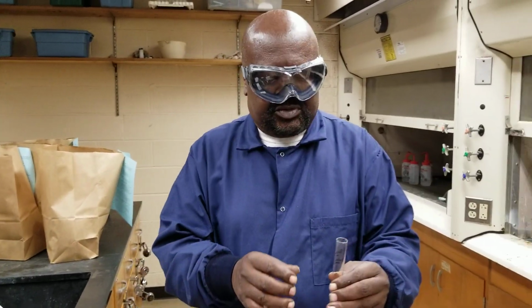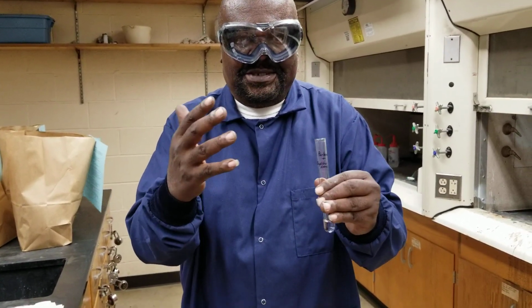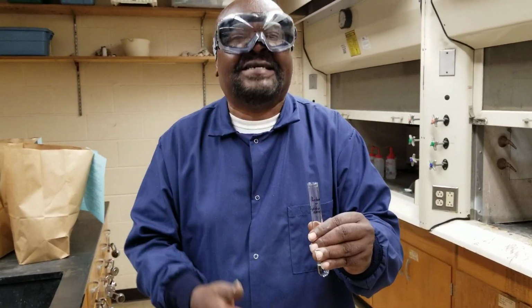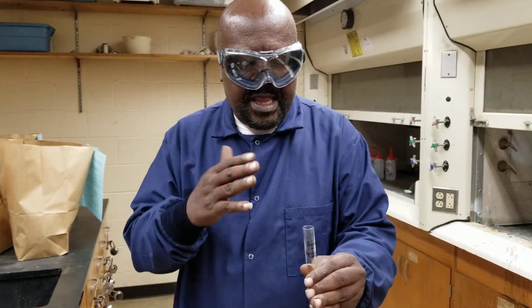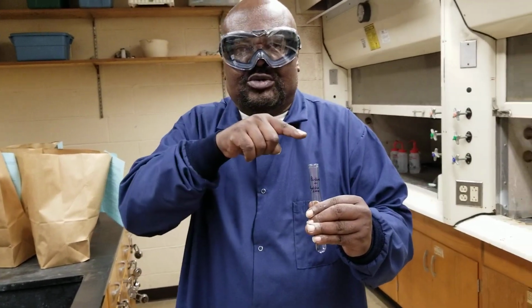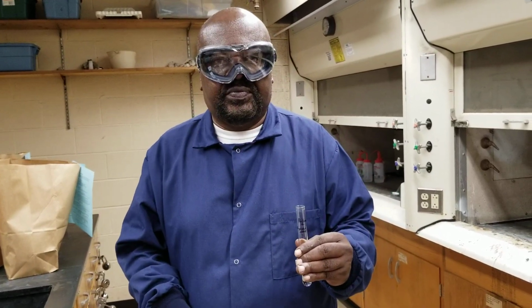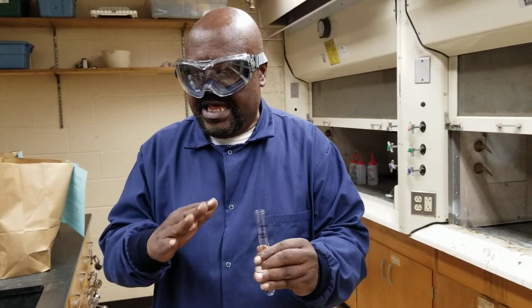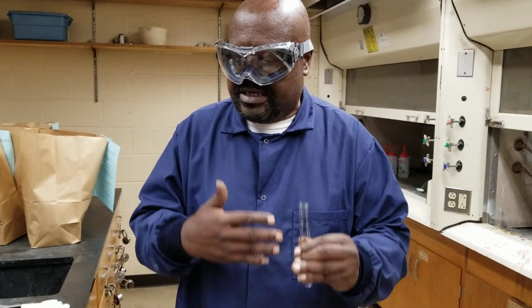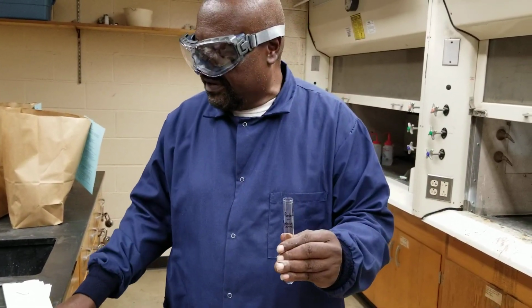And so, as we've described in the manual, and thanks for reading, digesting, understanding. You don't read it as a novel, you read it slowly, repetitively. That's how everybody gets it. So the central idea is that you must have favorable solute-solvent interactions for a solution to form. In the pre-lab, you profiled the dominant intermolecular forces in the solute and solvents, and now we will actually profile them to see what happens.